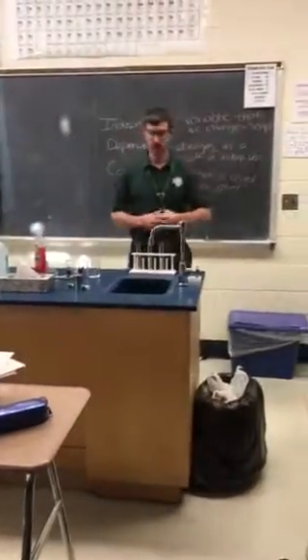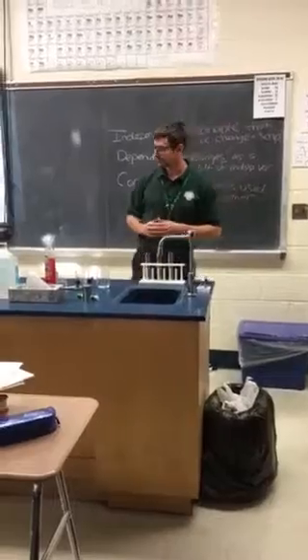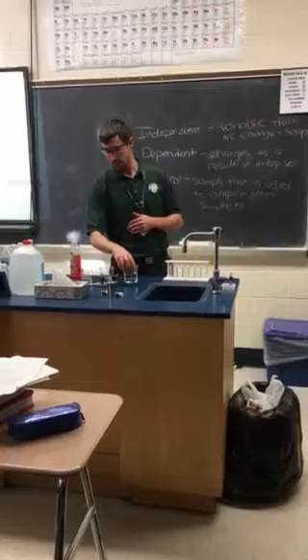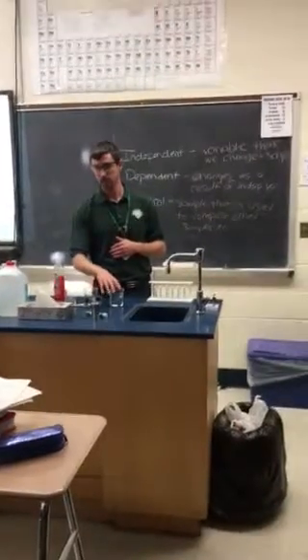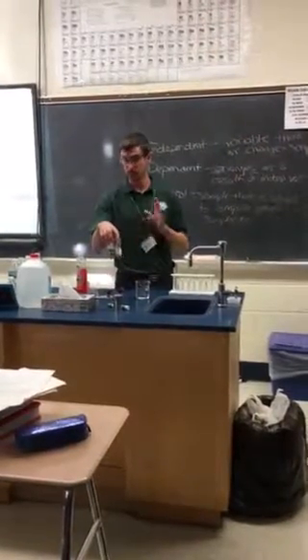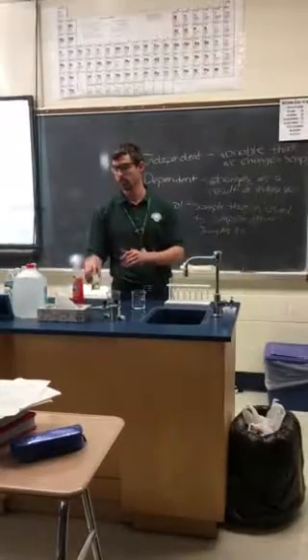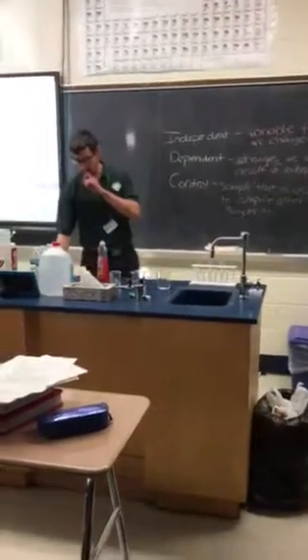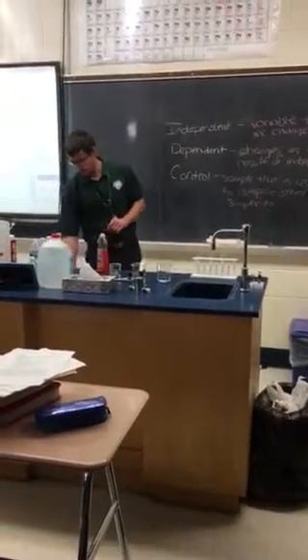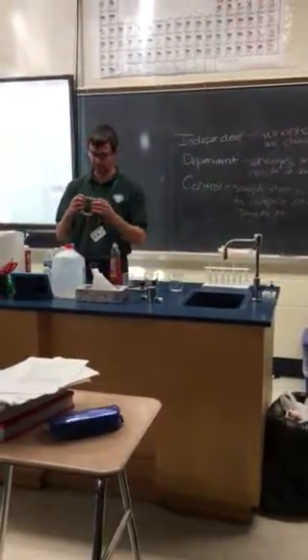Okay, and you'll follow this in your procedure, but you're gonna have your 3 water samples. You're gonna have your tap water. So this is Roselle water. You'll have your control, which is your hard water, and your distilled water, which contains no ions or very little ions. I was unable to get deionized water, which contains no ions, but this is the next best thing.